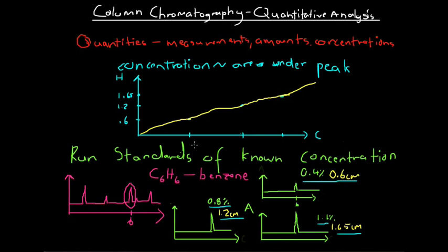Here our concentration is 0.4%, 0.8%, and 1.1. So if we put in brackets here, now this percent is a percentage by mass. However, as I said, if we used other units of concentration, we'd still have a successful method. So height is in centimeters.